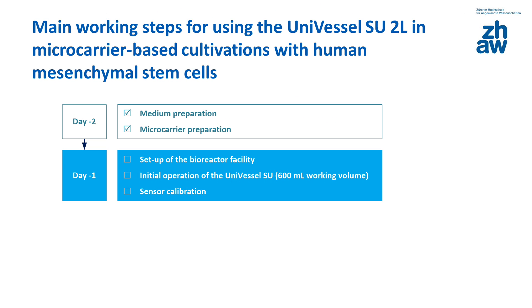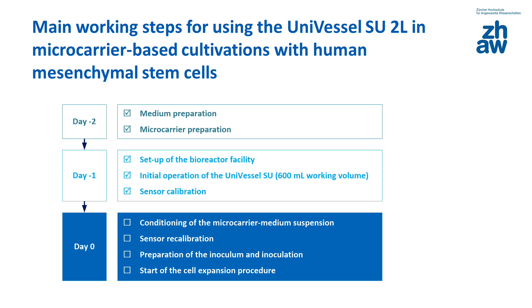After conditioning the microcarrier medium suspension in the bioreactor and carrying out sensor recalibration, we are ready for the cell inoculation. As in the spinner flasks, cryopreserved cells from the vial-based working cell bank are used. Each vial provides enough inoculum for one bioreactor.